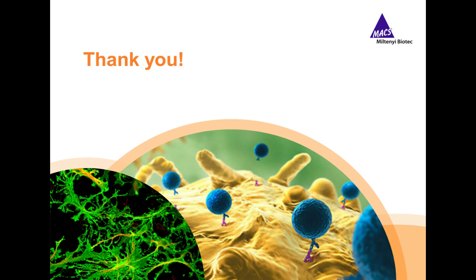Great, thank you. Can GLAST and ACSA-2 antibody also be used for Western blot analysis? The anti-GLAST antibody also works for Western blot. In case of the anti-ACSA-2 antibody, we saw that it's difficult to use for Western blot analysis. So in that case, we would definitely recommend to use the anti-GLAST antibody.